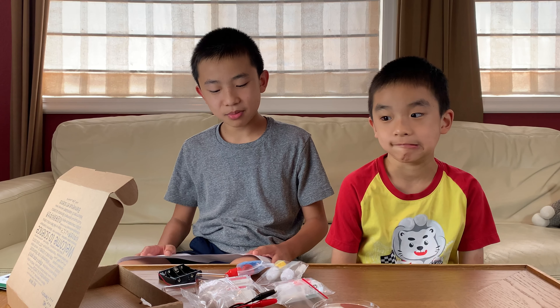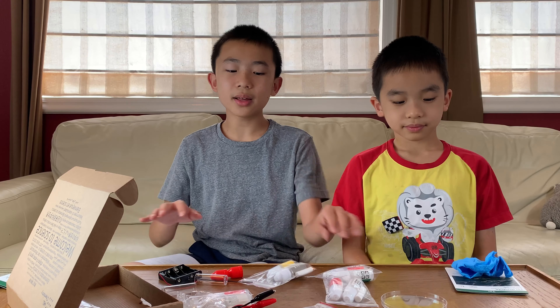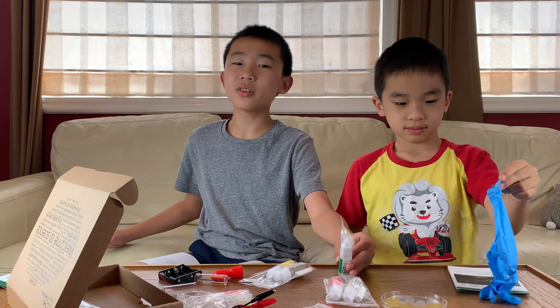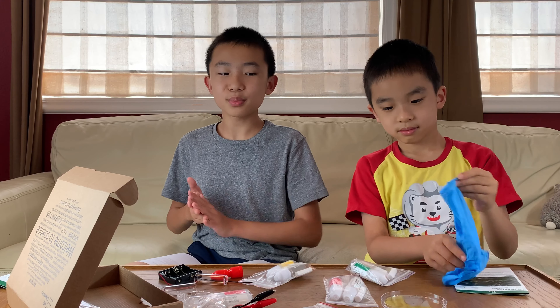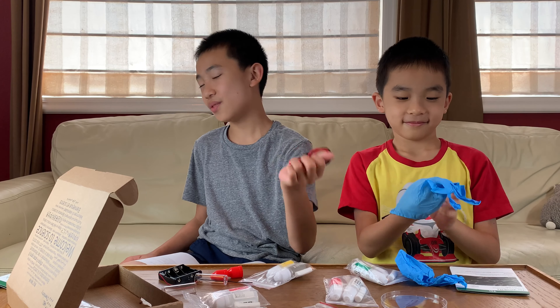And if it gets in our eyes, we rinse cautiously with water for several minutes. That is the unboxing. There are a lot of dangers to these chemicals, but if we handle them properly, hopefully we're fine. Aside from that, this looks like it'll be pretty fun.